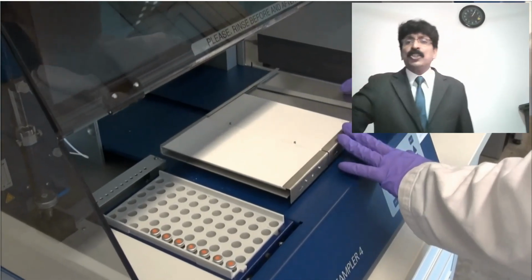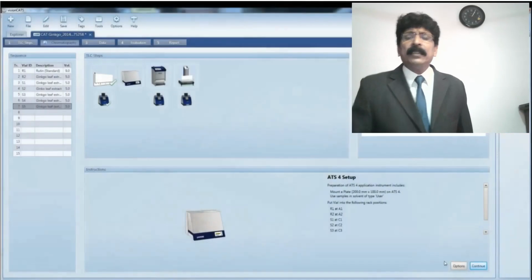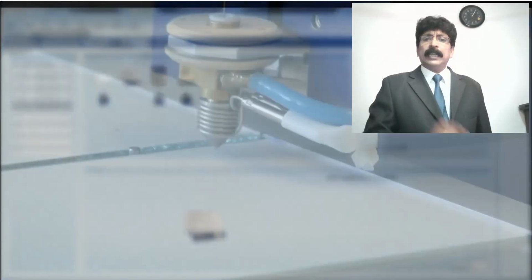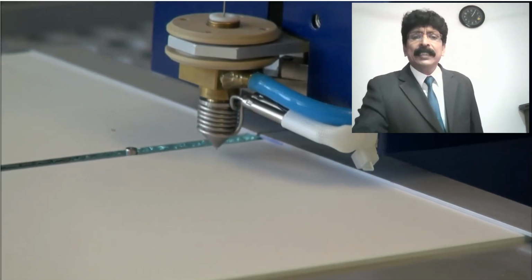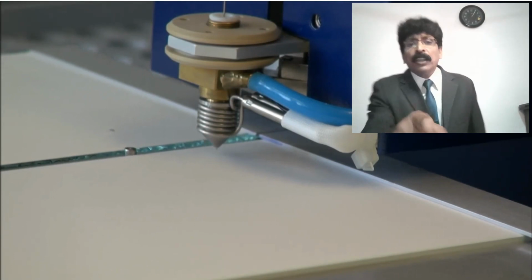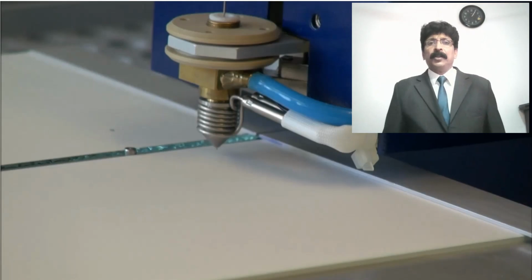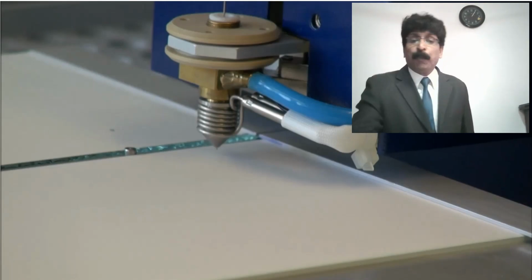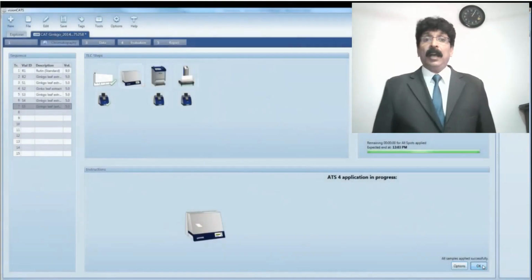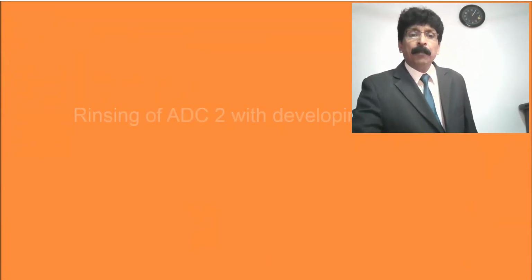Now you see the instrument, the automatic sampler. You can see here, when she gives the command in the computer, the instrument will start spotting. You see the needle and the sharp point, how it automatically makes the band over the plate which is kept inside the instrument. So the video was taken very clearly for the person to understand how the sampling is done in HPTLC.